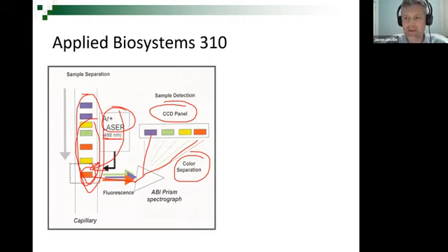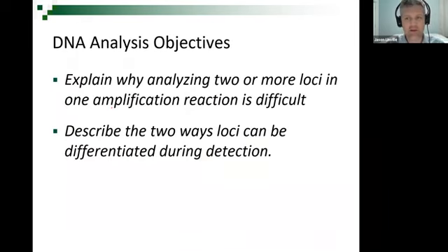If I ask you how DNA is detected at the detection window, I don't want you to write your short answer as a camera sees the DNA. No, I want you to say a laser excites the fluorescent dye attached to the DNA, and the camera sees the dye. You answer that, what is Dr. Linville going to do? I'm going to underline the words laser, dye, camera.